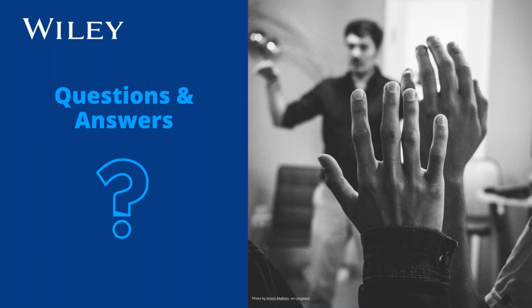Excellent, thank you, Michelle. Here's another good one. How are the quantification files stored? Can they be interacted with outside of KnowItAll? They're stored in a proprietary format. Right now, you cannot interact outside of KnowItAll, but it's a good point. It's stored, so we know how to export it. In certain situations, you may want to export as an Excel or some data format. So if there's a format defined, it's just a matter of export, so we should be able to support it. Good, thank you for that.